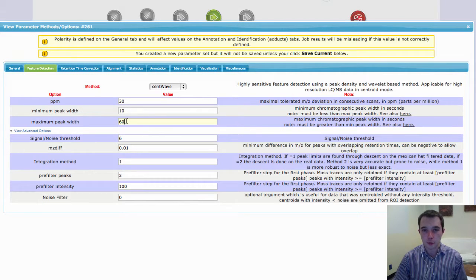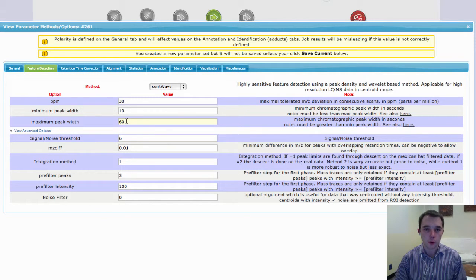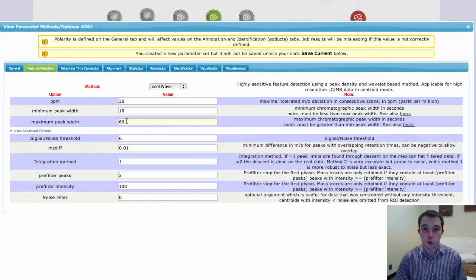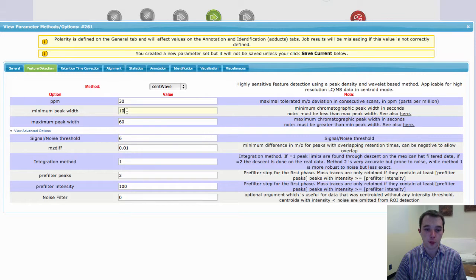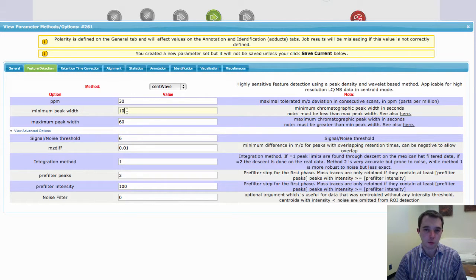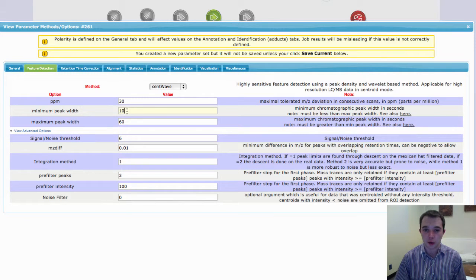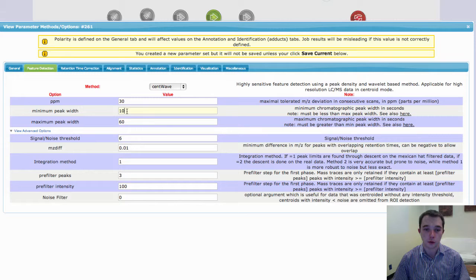Now, if you're running HPLC, maybe you want to set your maximum up a little bit more. If you're running UPLC, you probably want to set both of these values much smaller, maybe somewhere for your minimum around 2 or 5 in my experience, and your maximum probably somewhere around maybe 20 to 25 seconds, depending upon how your experiment actually looks.